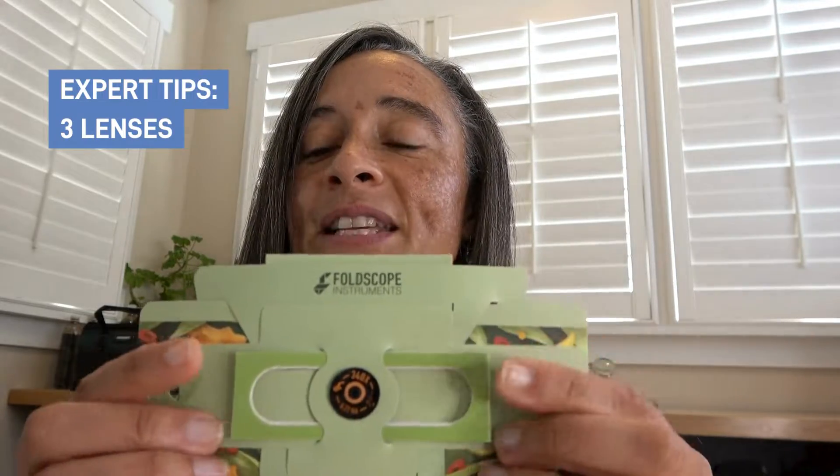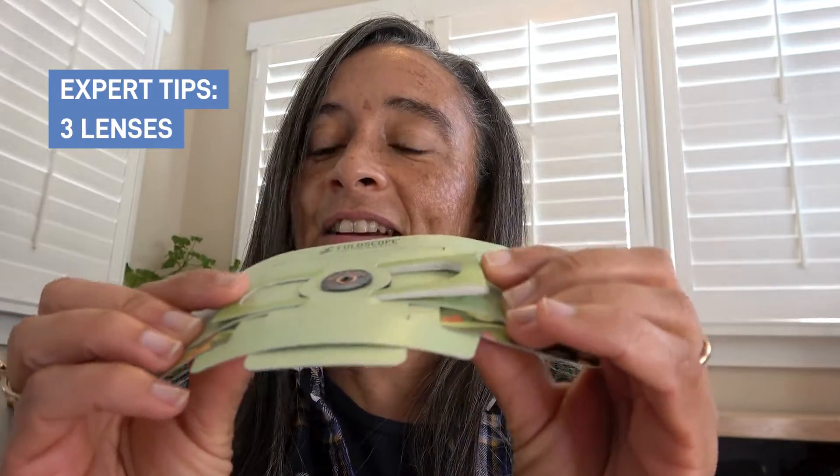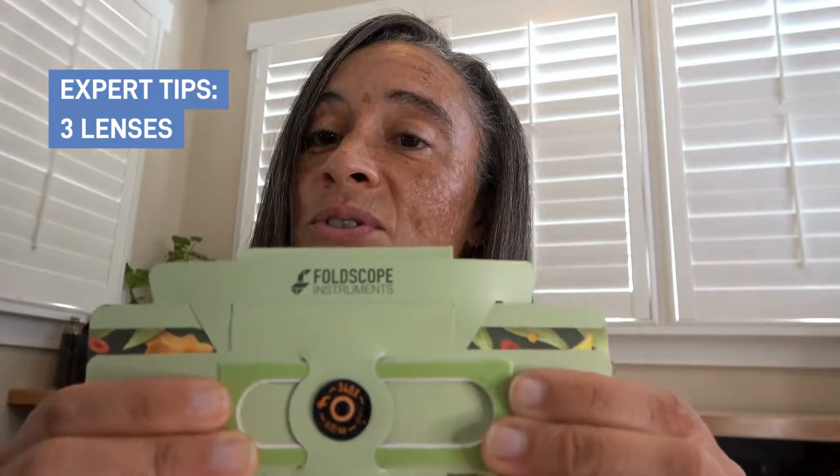Foldscope focusing is the same way with the 2.0 as it is for the original. By simply sliding the new, sturdier focus ramp — still with a thinner end and a thicker end — from the left to the right, which is bringing your sample closer to or farther away from your lens to bring it into focus.